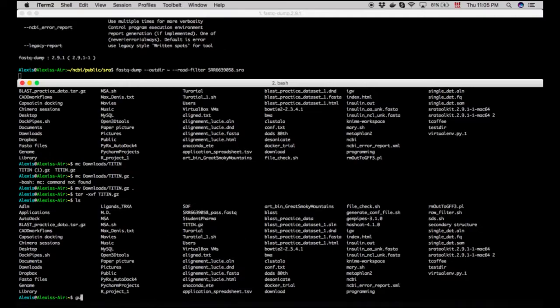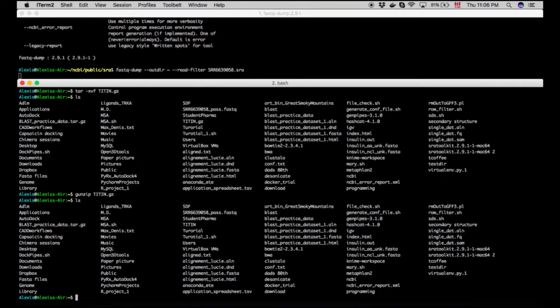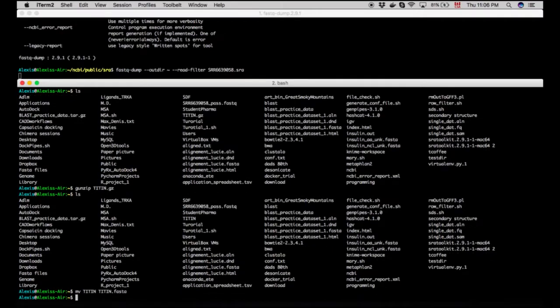Okay, we have Titin here. I'm actually going to move Titin to Titin.fasta. It's just going to make things easier.